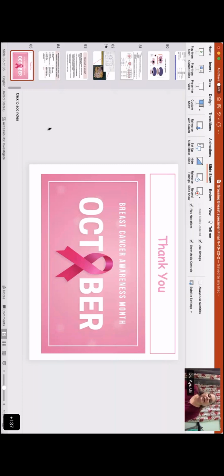And in the mastectomy, because of the therapy related changes and the prior excision and shrinkage of the tissue, whatever amount of tumor we are seeing, we cannot just add that to the previous wide excision tumor size and say this is the T size. So in such situations, it is not possible to give an accurate T size. So I think that's all.